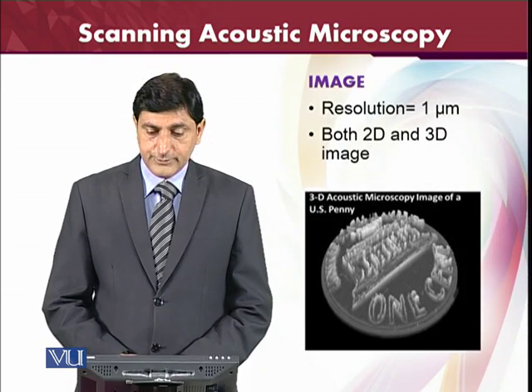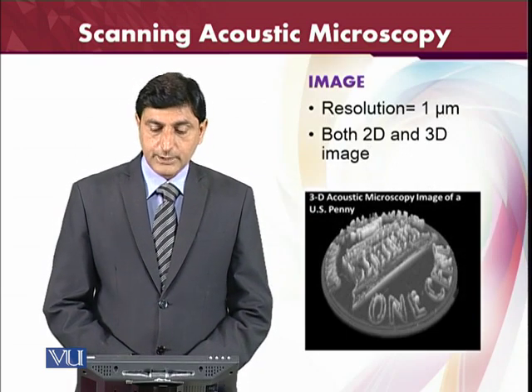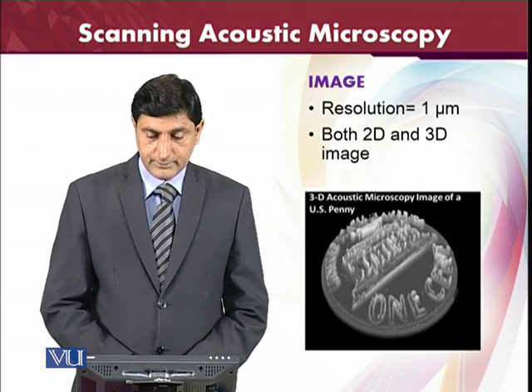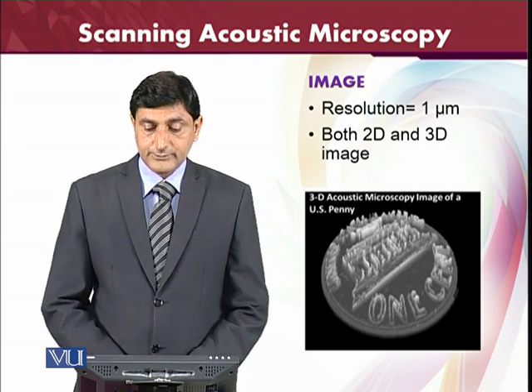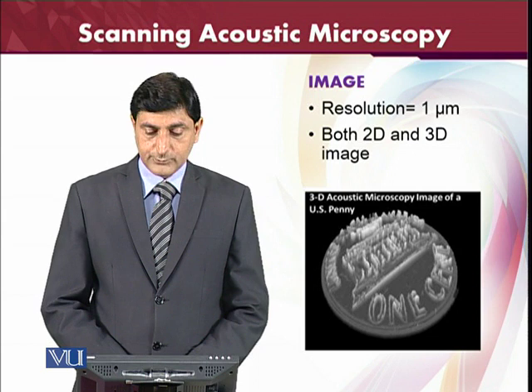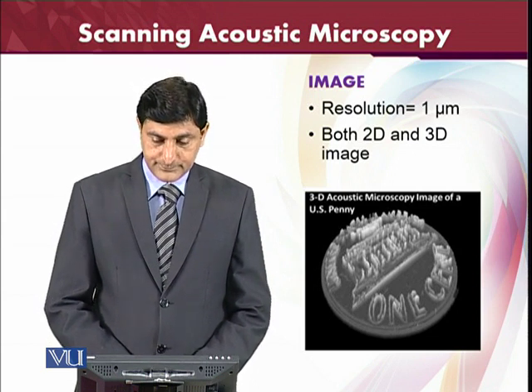The image resolution is about 1 micrometer, and both 2D and 3D images can become visible with such kind of microscope. Just as an example, we have given one of the slides here: a 3D acoustic microscope image of a US penny.